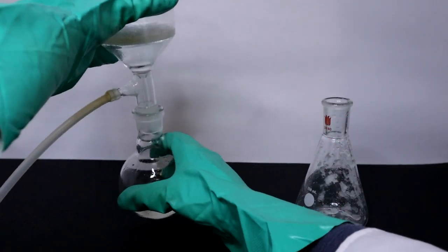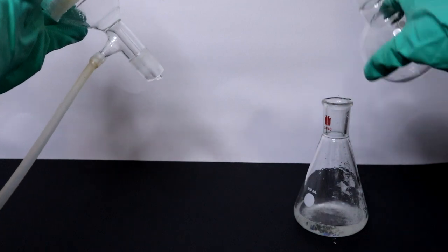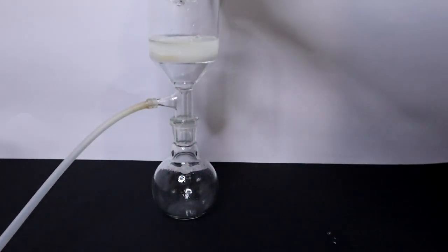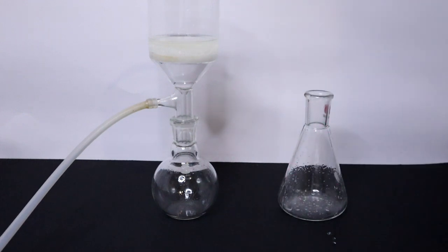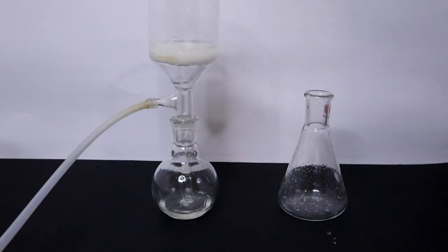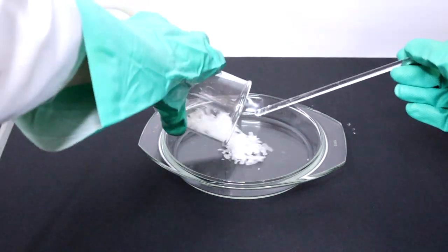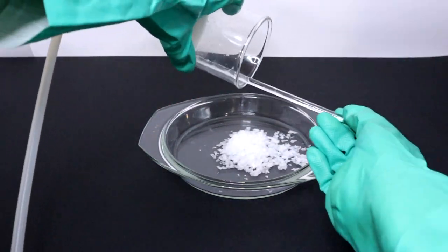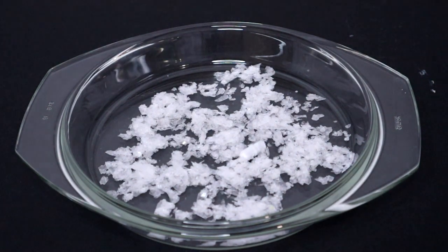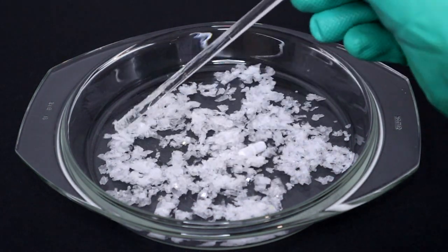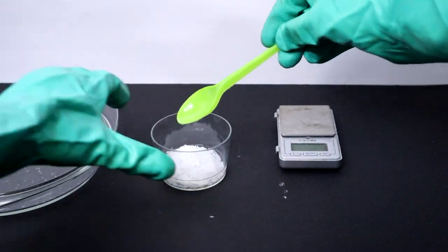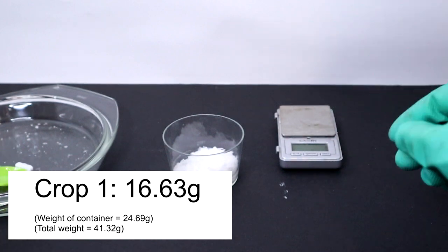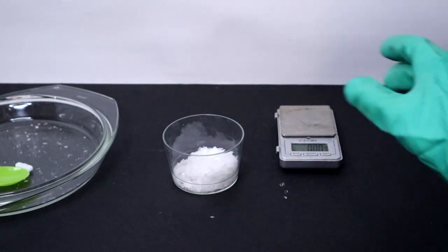To not add any additional water, I rinsed the reaction vessel with the filtrate. The crystals were then dried on the hot plate on low heat and weighed. The first crop of crystals came out to 16.63 grams, but fortunately there is still more product to recover from the filtrate.